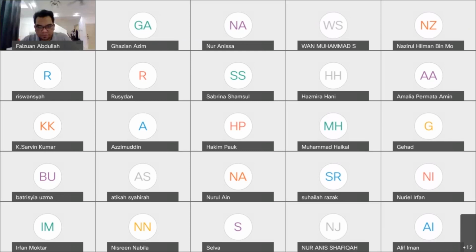Chromatography based student. Right, organic analytes using chromatography methods.